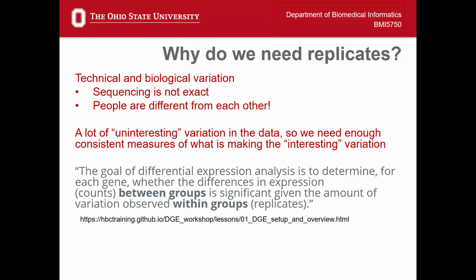The goal of our differential expression analysis is to determine for one gene at a time whether the differences in expression between our two main groups is different enough given the variations within our replicates.